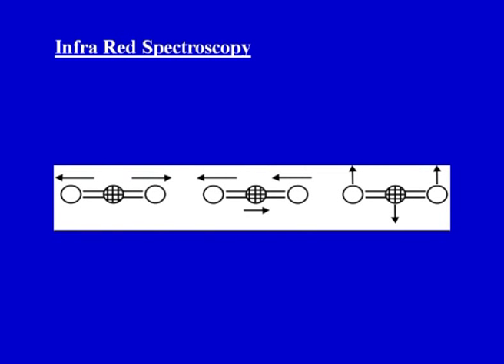So, if we have to determine whether some compound is IR active or not, consider for example carbon dioxide. Carbon dioxide has two oxygens which are double bonded to the central carbon. Here, a dipole moment from the symmetric stretch of the left oxygen will be offset by the symmetric stretch of the right oxygen, and therefore it is considered IR inactive. As you can see here, the stretches offset each other, and there could be different kinds of stretches in here.